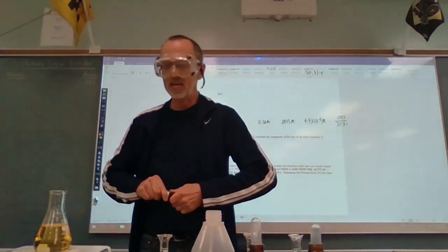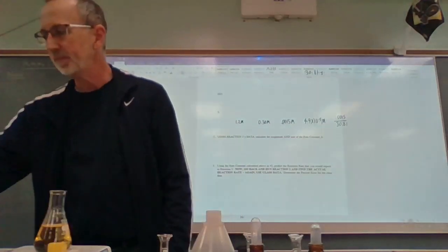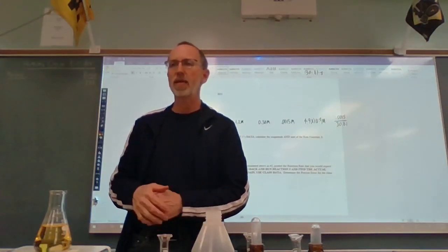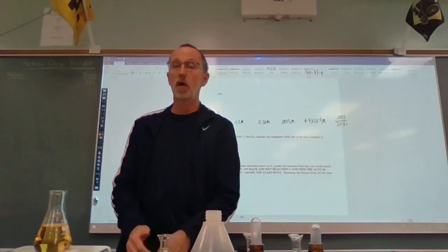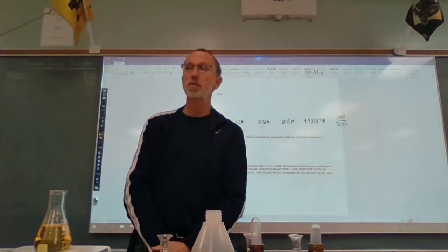So I think that finishes up Lab 12.1. I wanted you to see in real time how we go about determining a rate law. First of all, determining reaction orders for each reactant, and then determining a rate law.